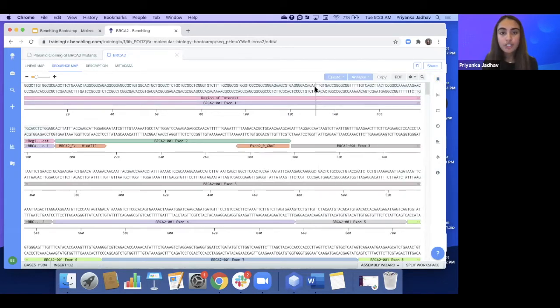Okay. So creating mutations individually is very good for one-off markers that you want to make. But let's say that for every BRCA2 sequence that I import, I have a large set of features that I want annotated onto it. And I don't want to manually have to annotate those features individually. Benchling allows you to create something called a BRCA2 feature library. So today I'm going to be adding a feature to a library that exists called BRCA2 features. And then I can auto annotate my entire sequence with items from that feature library to reduce a lot of the manual work that comes with individually annotating my sequence.